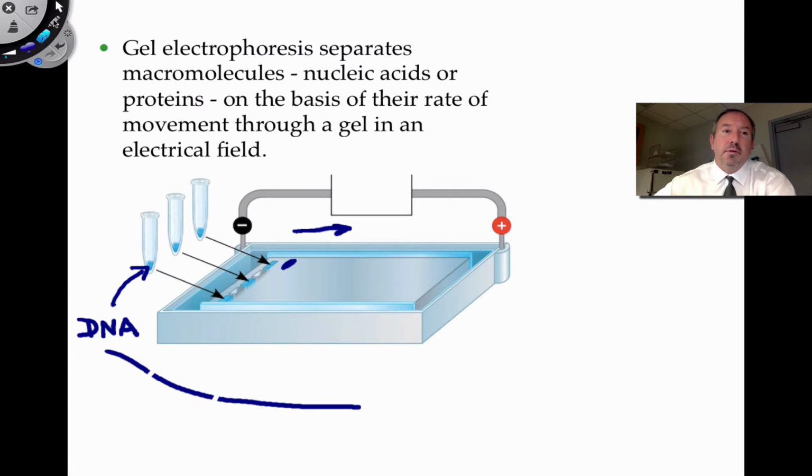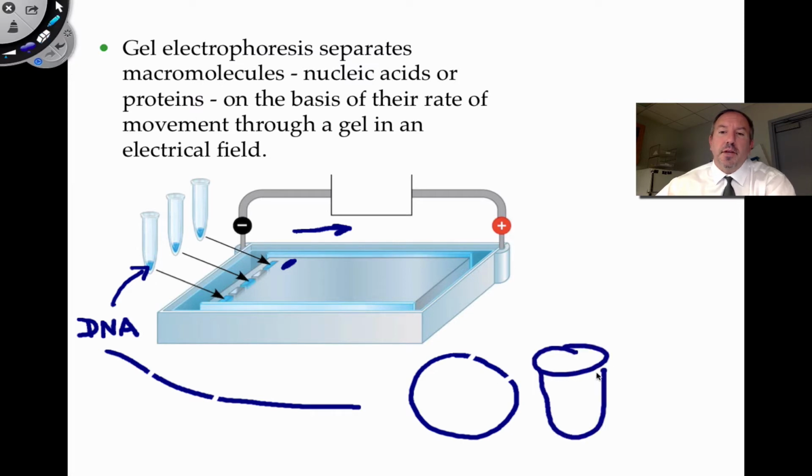For example, a plasmid. If you were going to apply a restriction enzyme to this plasmid and it makes a cut there and a cut there, you wouldn't know it. If you had the sample over here and you digested this, you'd have a small piece and a large piece, right? But you wouldn't know that. It sort of looks like just a clear liquid.